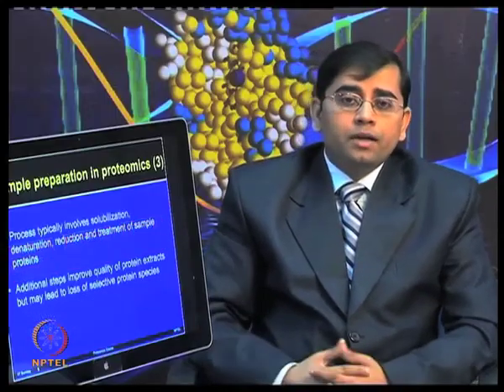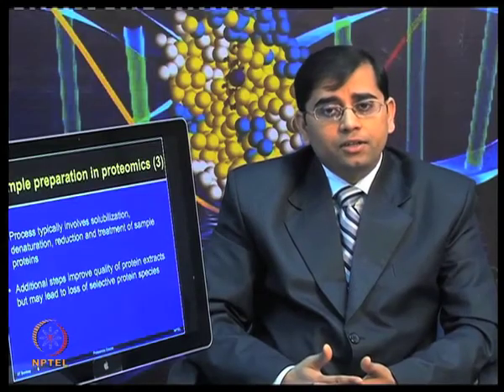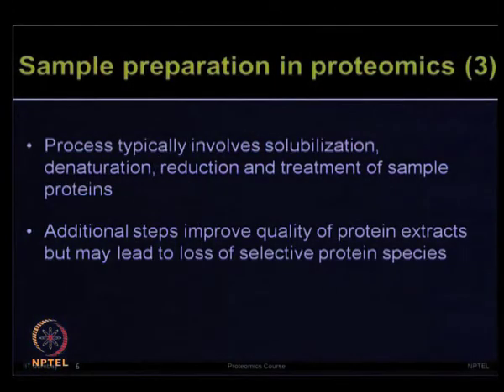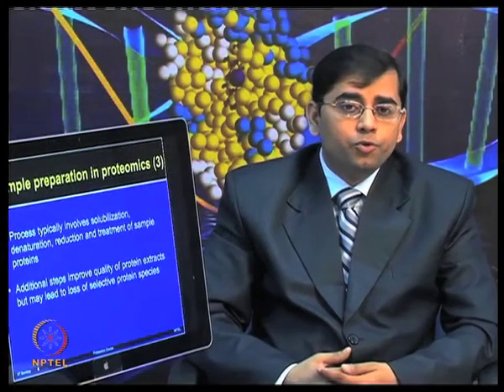Now, all of this sample processing involves solubilization, denaturation, reduction and treatment of sample proteins, but you need to involve additional steps depending upon the type of samples and your type of objective, so that the protein quality, the protein extract can be improved.